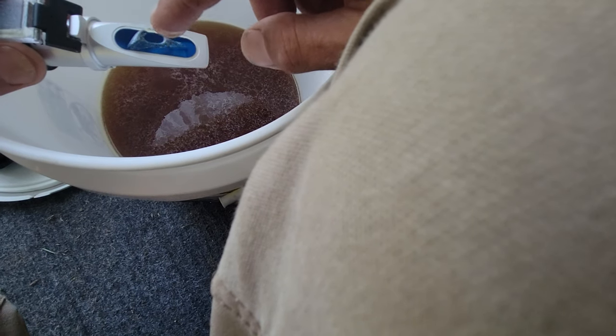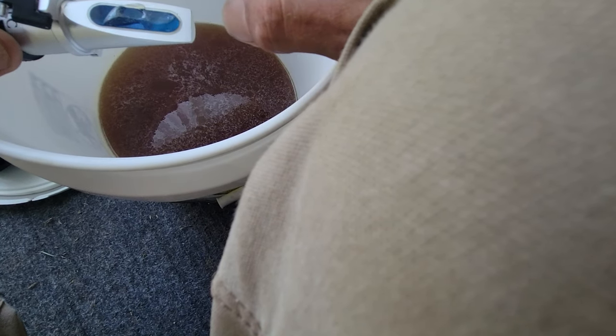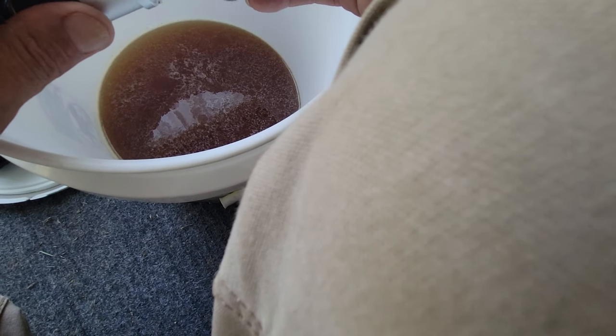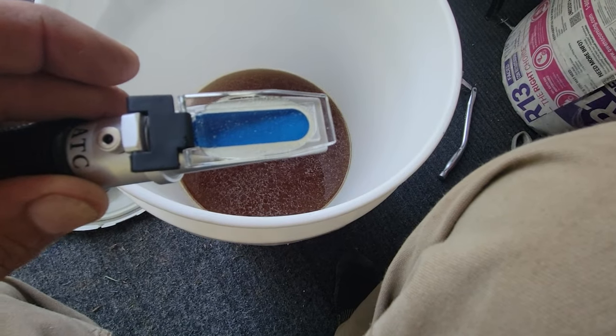So obviously there's no honey on there yet, so we're not going to get a reading. So let me put a little bit of honey on here. We're going to get one little drop of honey, put it right down on the lens like so. We're going to close it up and you'll be able to see that there's no air bubbles in that.